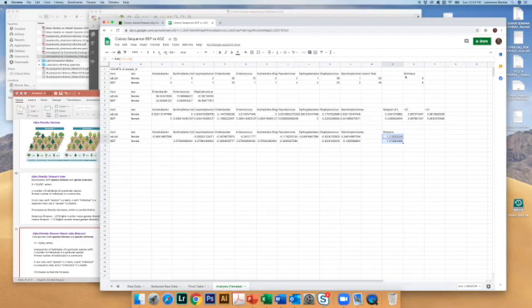These variables, the richness, the Simpson values, the Shannon values, the most common genera, and the percentage representation, all of those data could be part of the results in your report on a study asking whether there's a difference between the microbiomes that came from beetles from adzuki beans and the microbiomes that came from black-eyed peas.